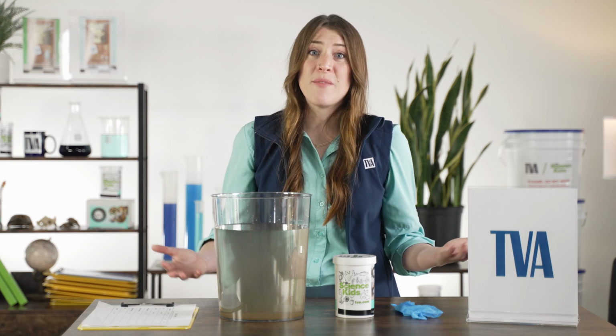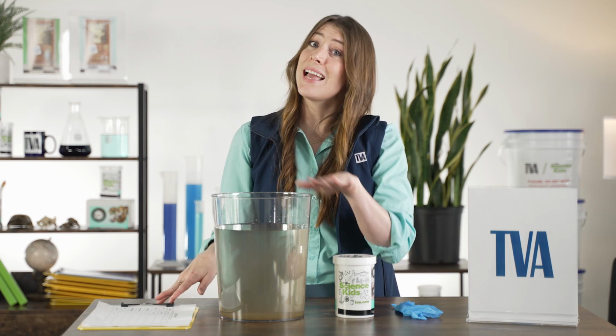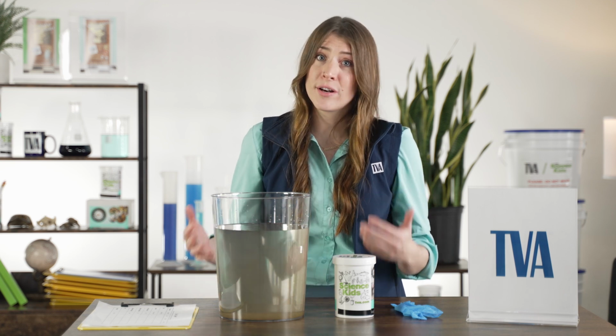Now that we've checked our equipment and set up our data sheet, we can collect our water and start the first experiment. This first test we're doing is our water temperature test. We're checking the temperature of the water.